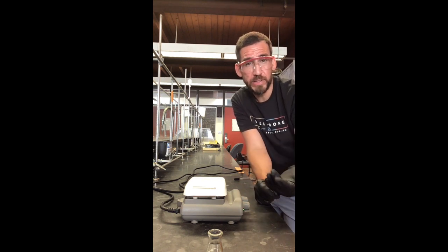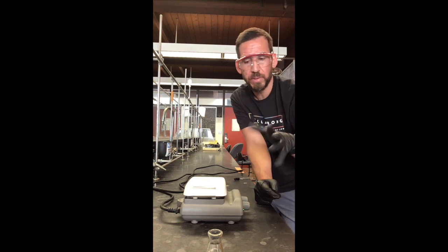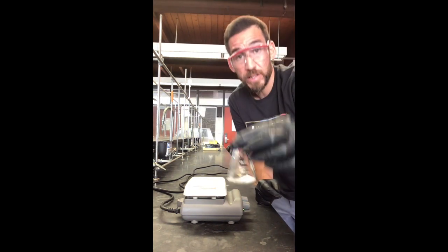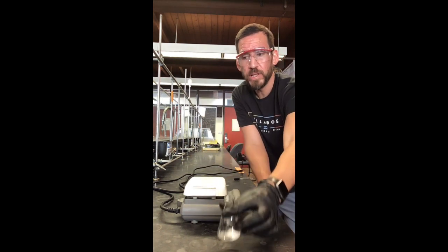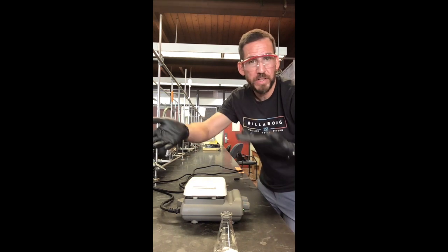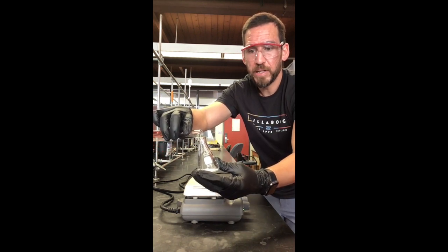Okay, and so I want to point out again, since we are doing this recrystallization process in hot solvent, we have to put it on a hot plate. And since we're working with ethanol, this is fine to be working with on the benchtop. But we don't want to place this lovely 508 milligrams of caffeine on the hot plate right away. I did the process already, and so I determined personally that I like about 15 milliliters to start with this amount of caffeine. And so I measured out 15 milliliters, and this would be something that might be in the procedure already.